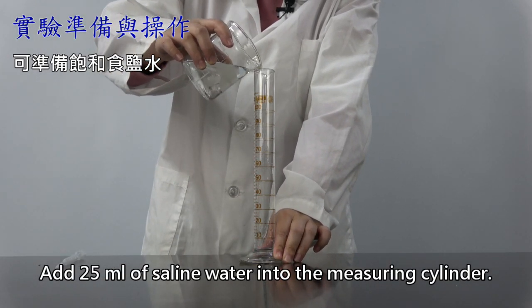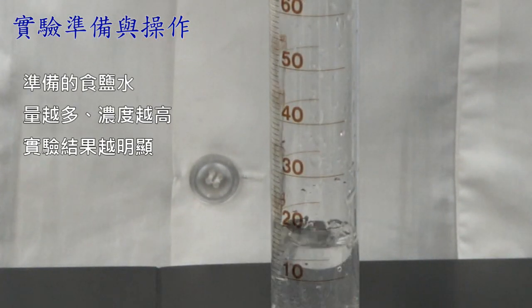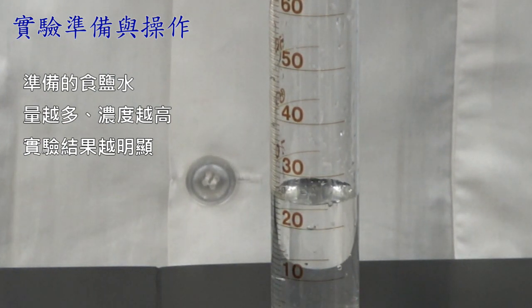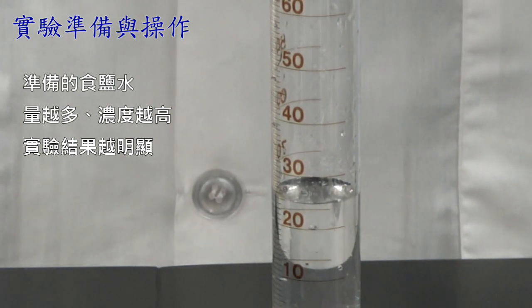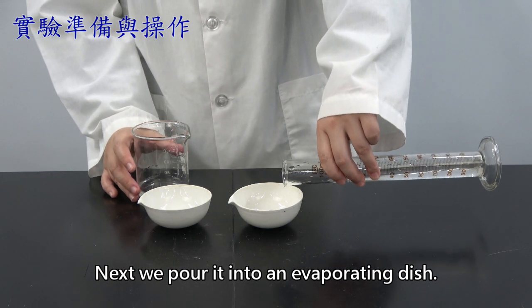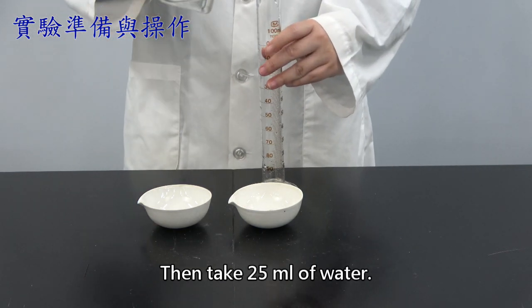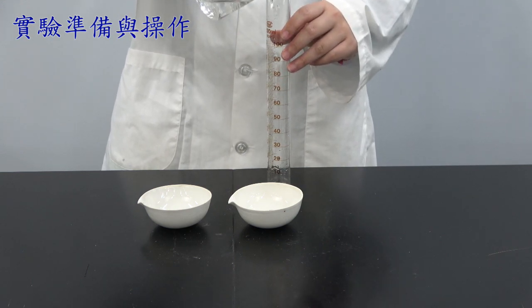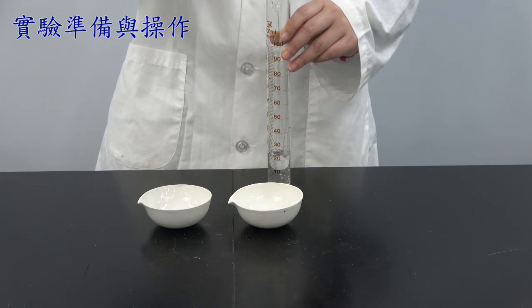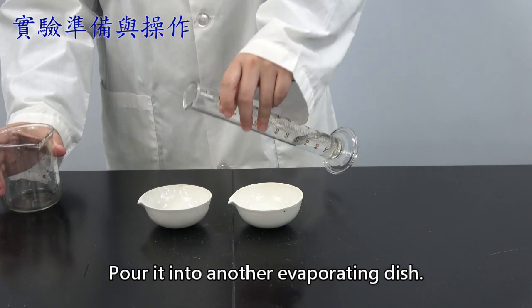Add 25 ml of saline water into the measuring cylinder. Next, we pour it into an evaporating dish. Then take 25 ml of water and pour it into another evaporating dish.